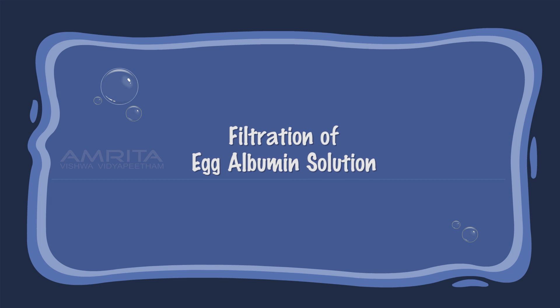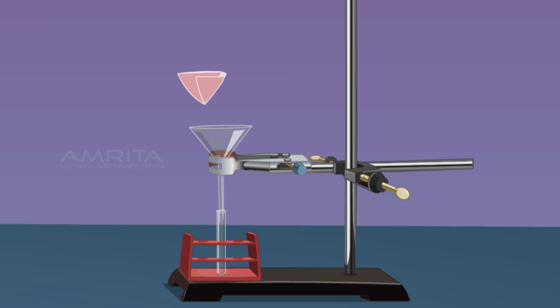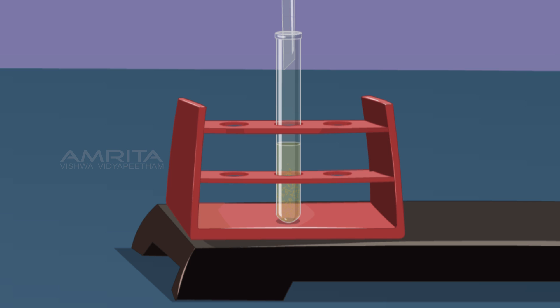Filtration of Egg Albumin Solution: Place a funnel over a test tube using a clamp stand, then place a filter paper in the funnel. Now pour the colloidal egg albumin solution through the funnel. A translucent filtrate is obtained with no residue left on the filter paper. This indicates that components of a colloid cannot be separated by filtration.